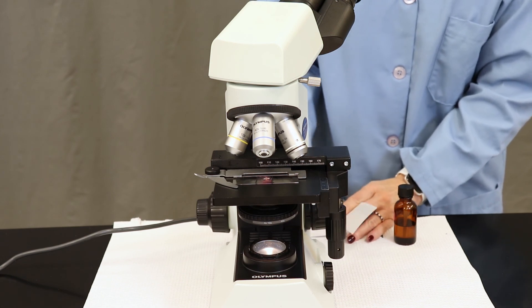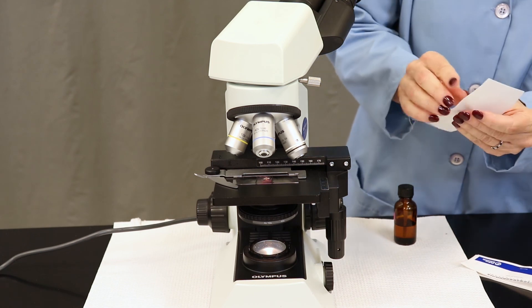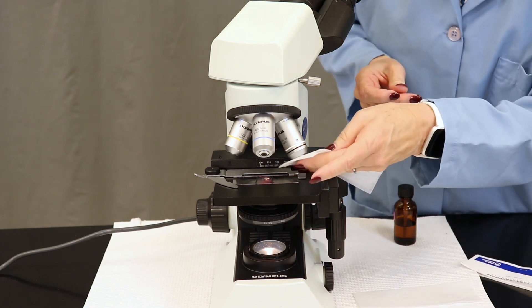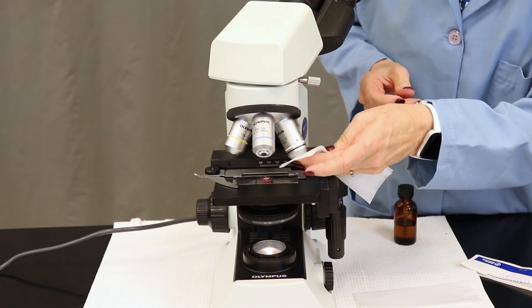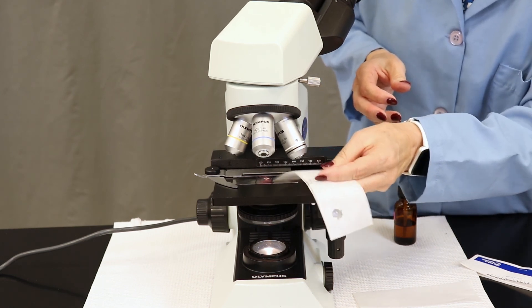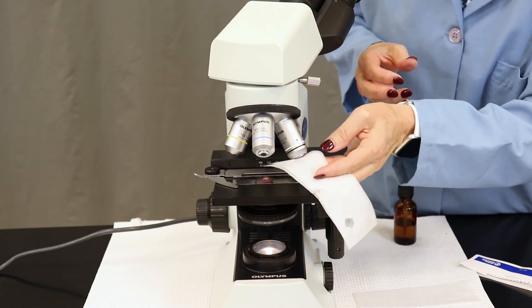You're going to use a fresh piece of lens paper from your kit, and you're going to use the fresh piece in order to wipe off the oil from the 100x objective. Gently blot until no more excess oil comes off on the lens paper.